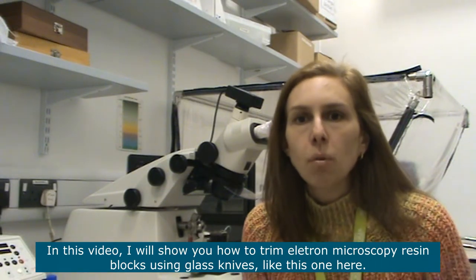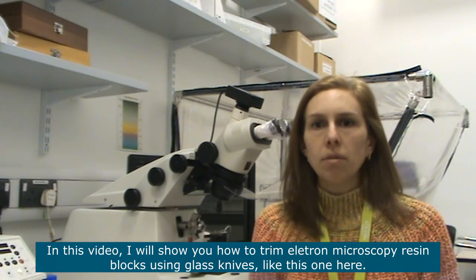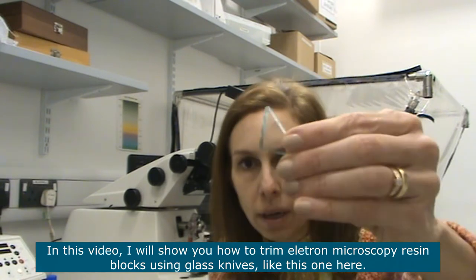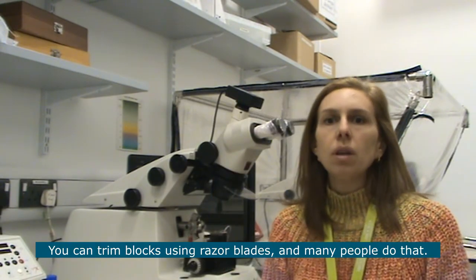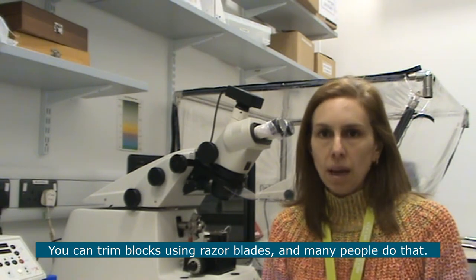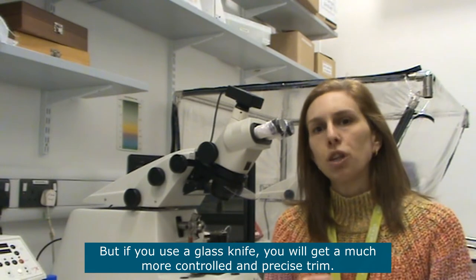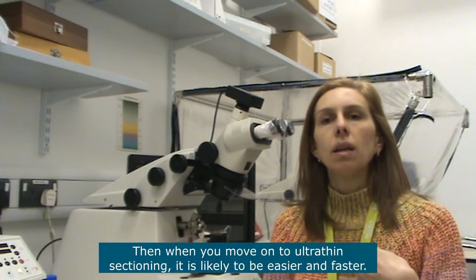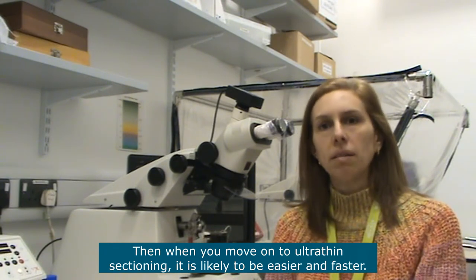In this video I will show you how to trim electron microscopy resin blocks using glass knives. You can trim blocks using razor blades and many people do that, but if you use a glass knife you will get a much more precise and controlled trim, which means sectioning is likely to be much faster and easier.